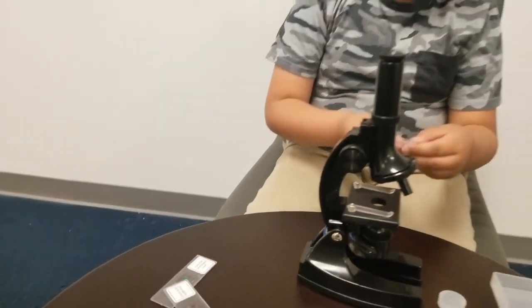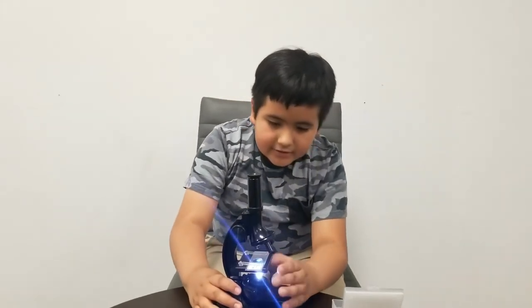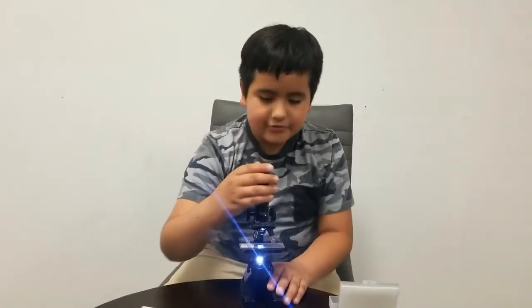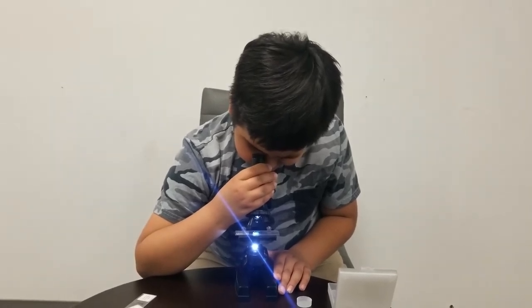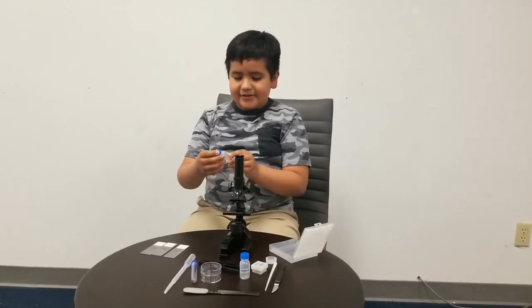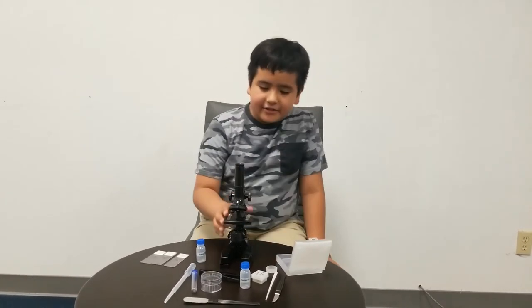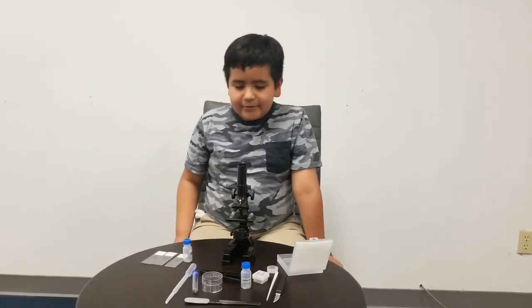You're going to want to put the slide under here and turn on the light, get this into the right position, and then you can see. We're going to start off with the 150x and then move on to the rest. I can definitely see it. You can also find your own specimens, put them in a specimen vial, create your own slides, and study them under the microscope. I would definitely buy this again — I'd rate it an 8 out of 10.